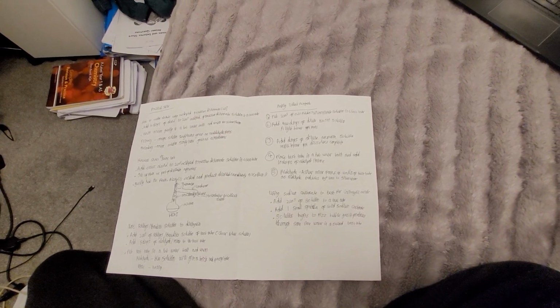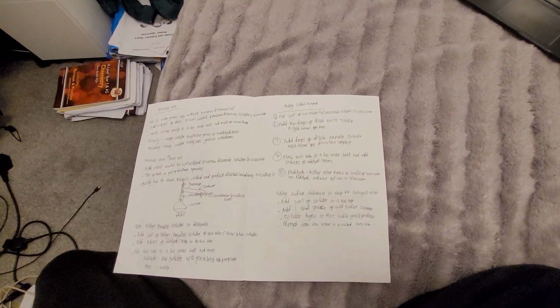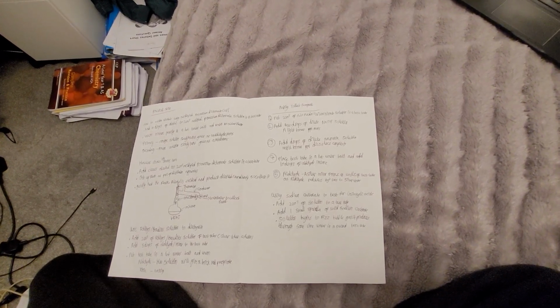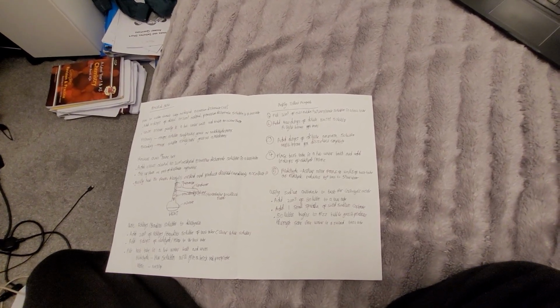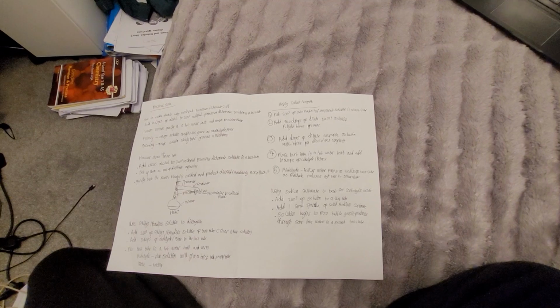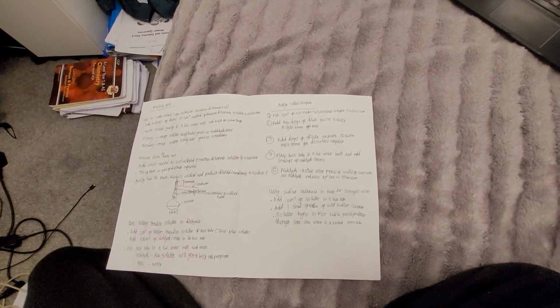And one other thing I forgot is using bromine water to test for the presence of alkenes. I'll just go through this, I don't write it down. Add 2 cm³ of the solution you want to test to a test tube. Add 2 cm³ of bromine water to the test tube. Shake the test tube. If it's an alkene, the solution decolorizes. It goes from orange to colorless. And if it's not an alkene, nothing happens.